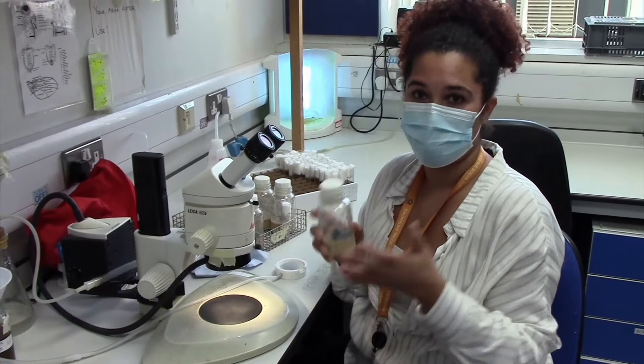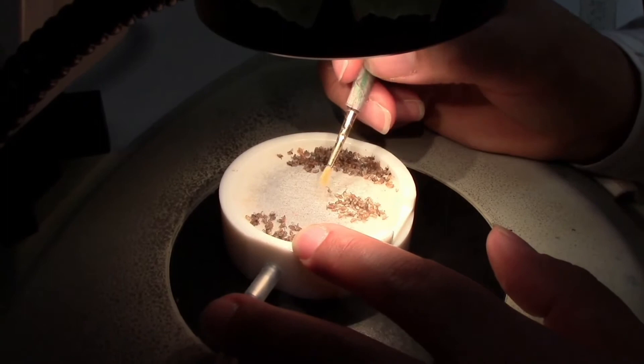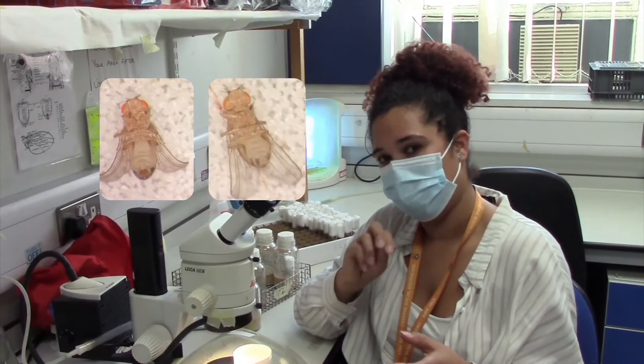When we need to do crosses and we need to select flies, we have to put them on the pad. This pad is connected to CO2 and it makes them fall asleep so that we can actually sort them — like separate the males from the females and the virgins.